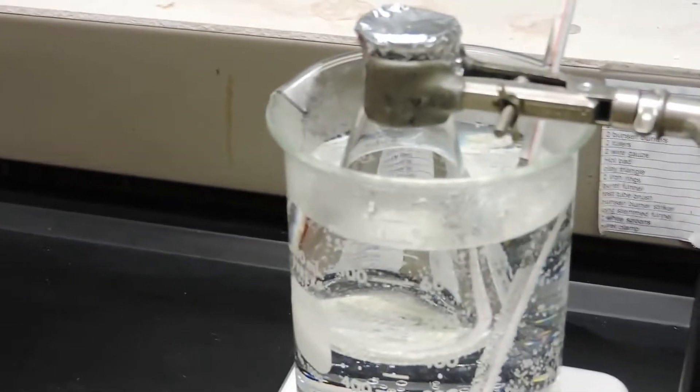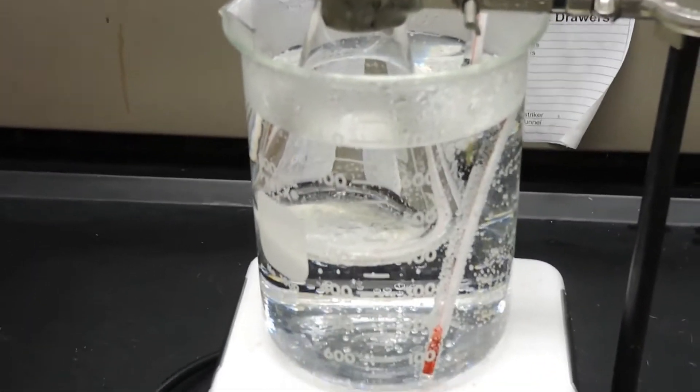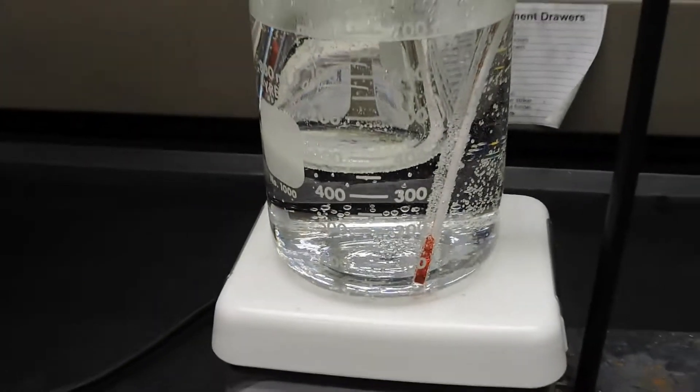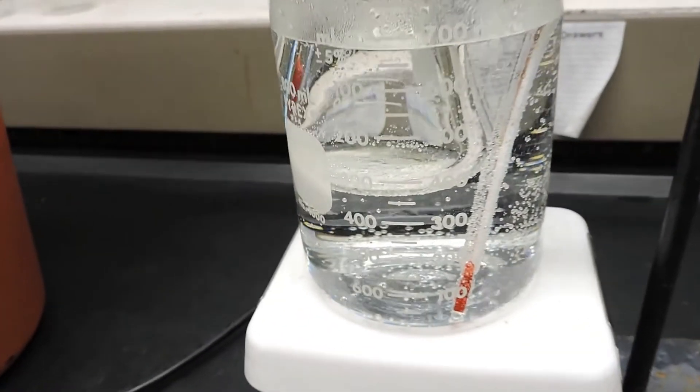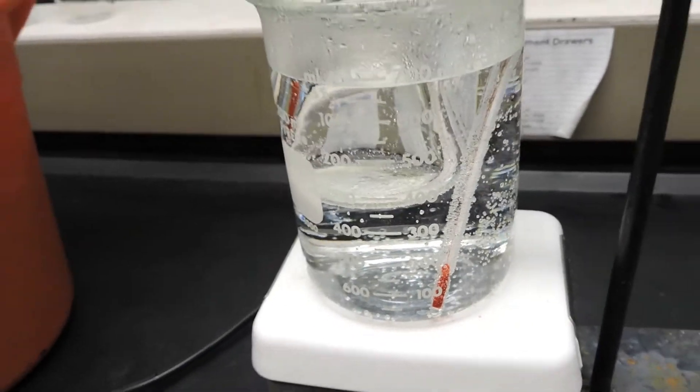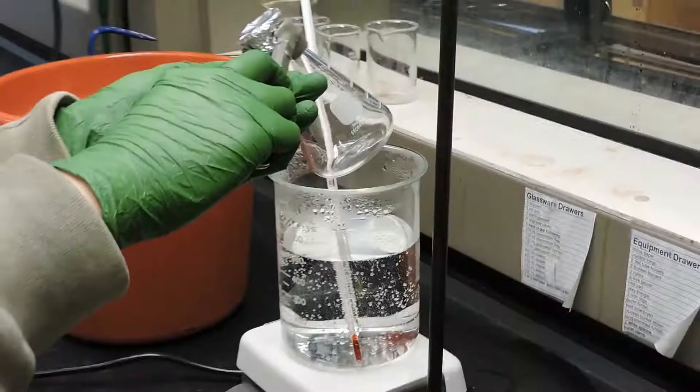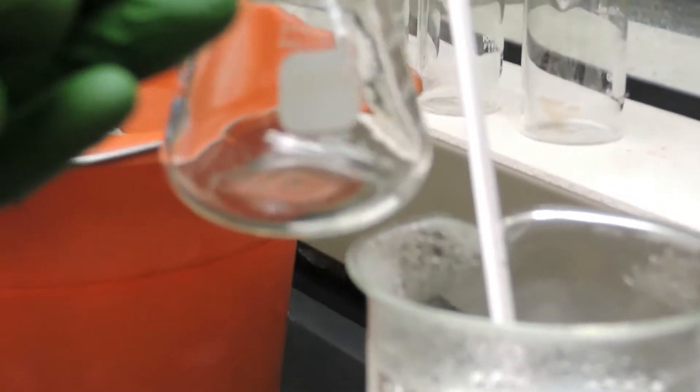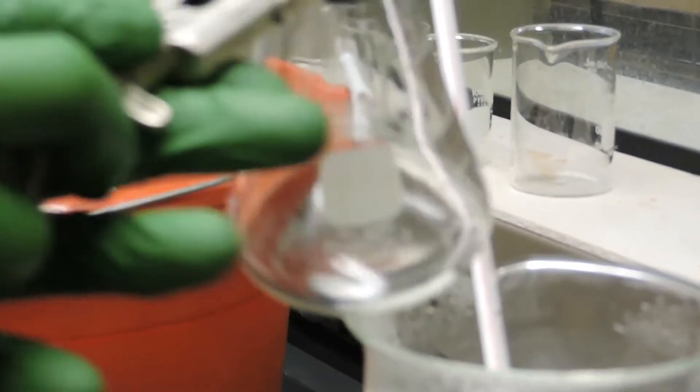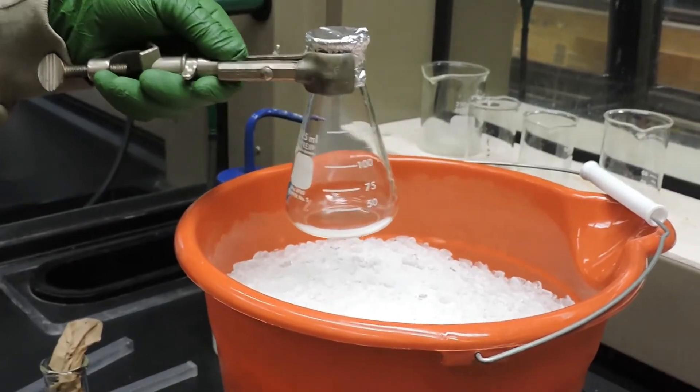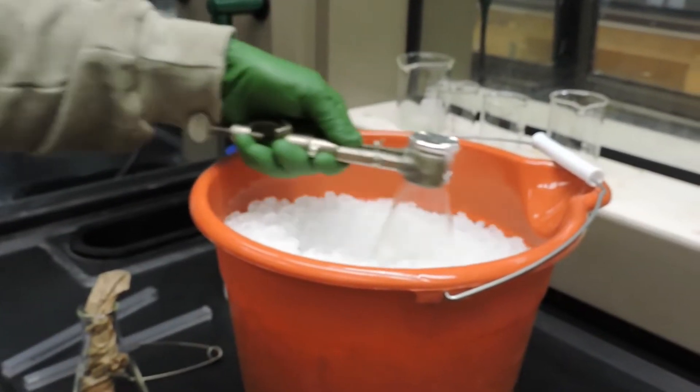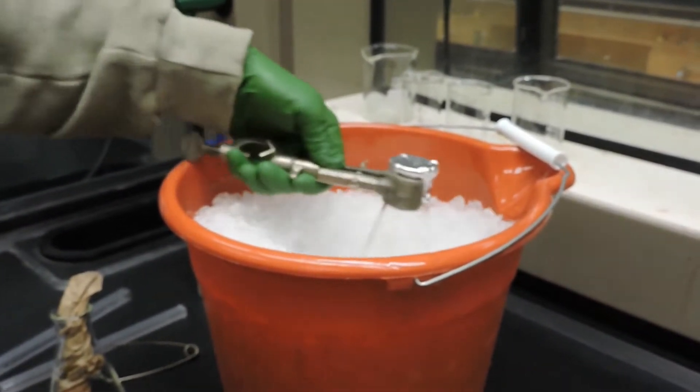We will continue heating at the boiling point of water until the liquid has vaporized. Upon analysis, you can see that the unknown liquid we put in the flask has evaporated, and now we're going to take this and place it on the ice bath to cool it down and recondense the vapor in the flask.